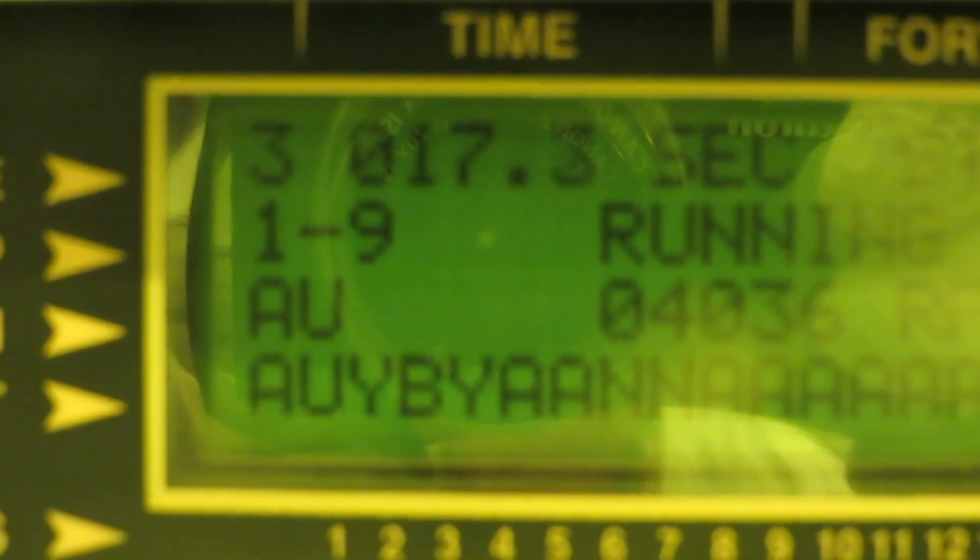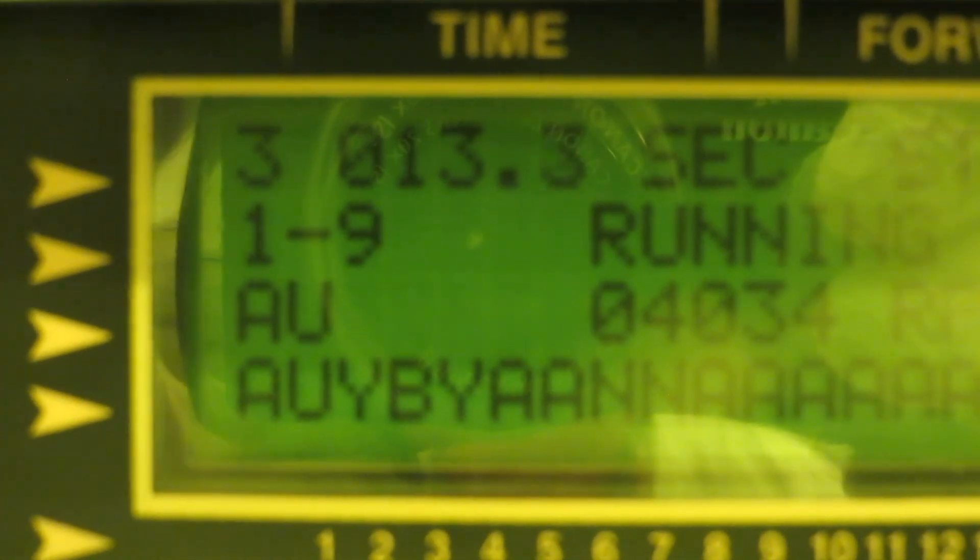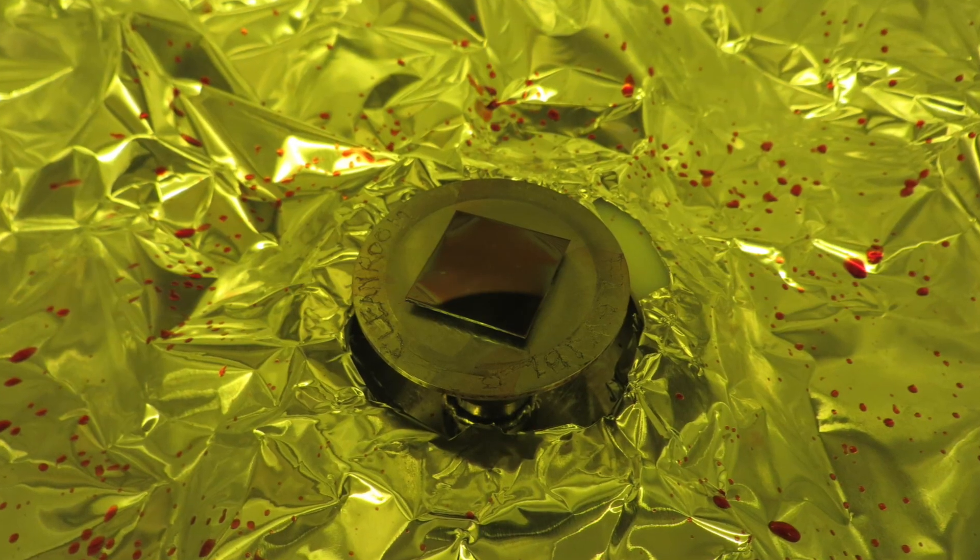You can watch a countdown clock up on the spinner controls. When it gets to zero, it will hold for a couple more seconds before it releases vacuum. Then you're done.